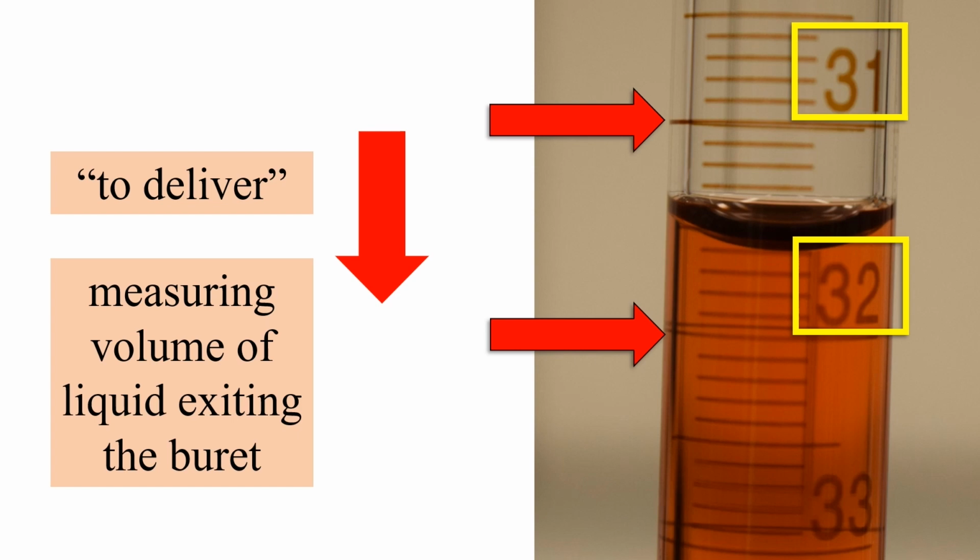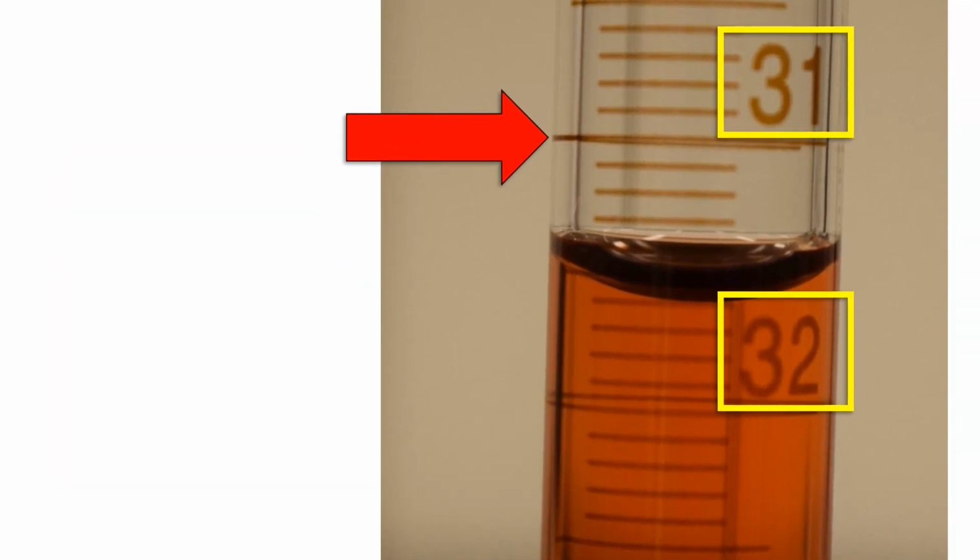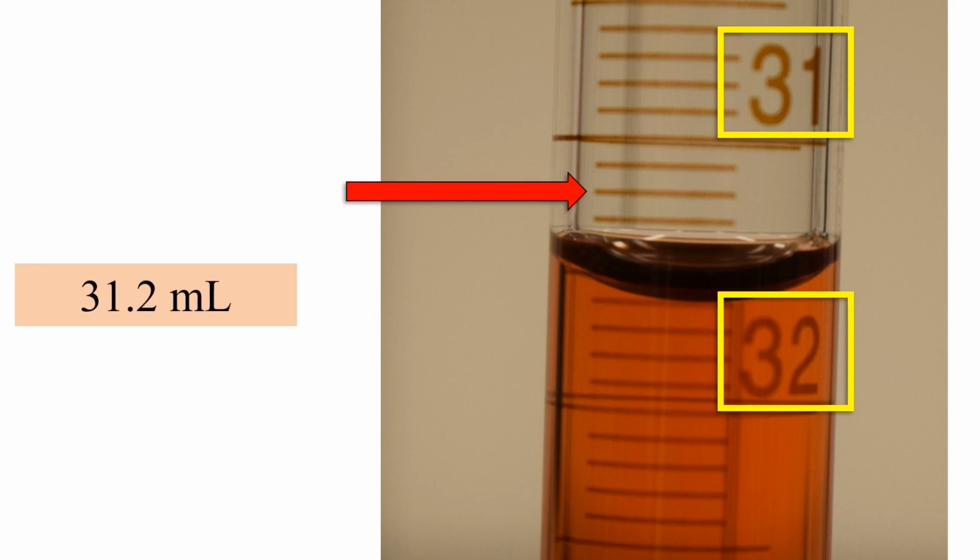Let's zoom in a little closer. Every milliliter is divided into tenths. So we can read 31.1 milliliters, 31.2 milliliters, 31.3 milliliters, 31.4 milliliters, 31.5 milliliters is difficult to see here because of the meniscus. But you can certainly see the bottom of the meniscus is touching 31.6 milliliters. Because we always estimate one uncertain value, I'll add a zero to the reading.